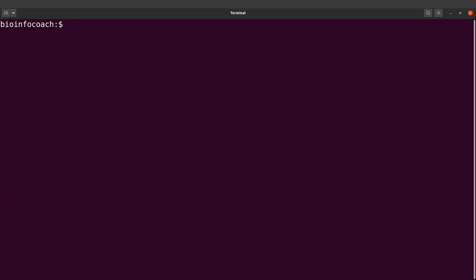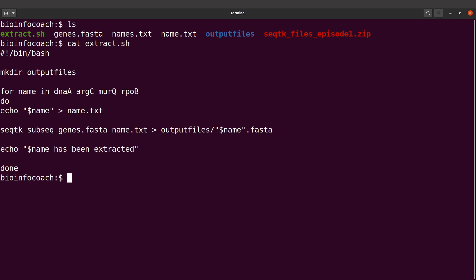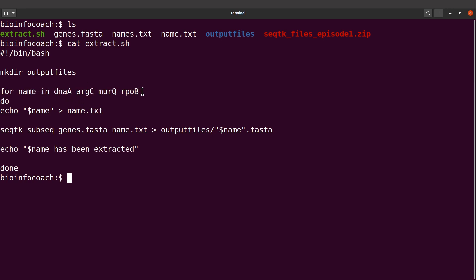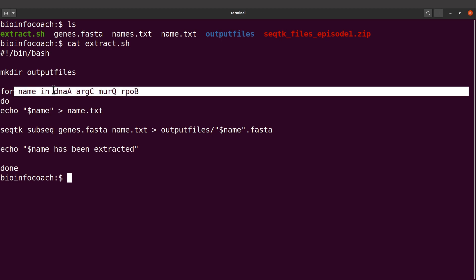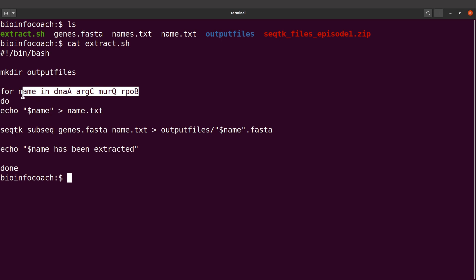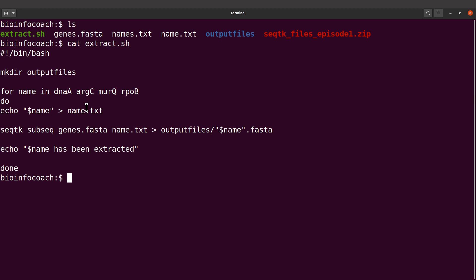Now let's review our script. With the commands we have, let's take a look at the loop. We had four sequences, and using this approach was fine because it's a small number. But if you have 50, hundreds, or thousands of sequences you want to extract, then this approach for specifying sequences in the loop will not be appropriate — it can be cumbersome. There are better approaches which I will cover in other tutorials. If you have lots of names, you can always contact me and we can work something out.